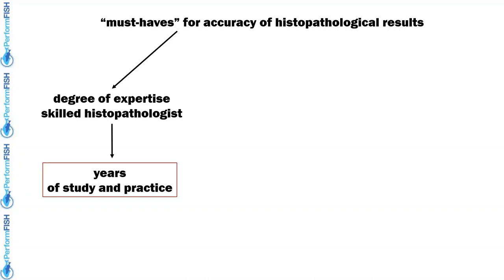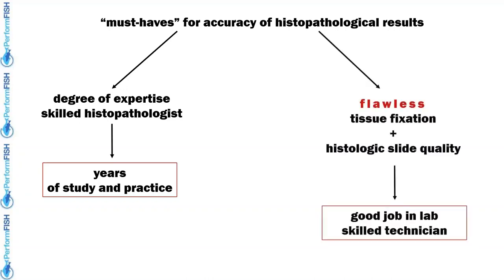Experience dictates that the three most frequently encountered causes of misdiagnosis are inadequate tissue fixation, poor histologic slide quality, and of course a lack of histopathologic expertise.